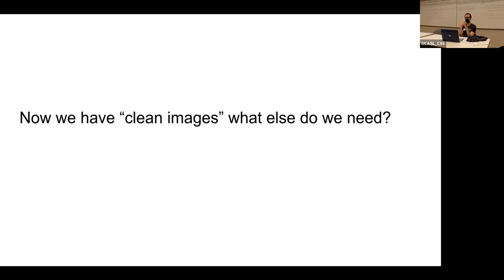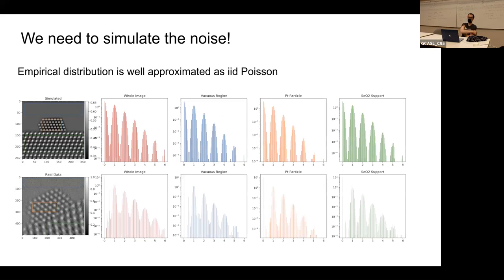But hold that thought, because there is actually a way of training neural networks on noisy images directly. I don't have a slide about that, but I think it's worth mentioning at the end. It's not obvious, but even in very recent work, it's possible to train neural networks with just the noisy images. So indeed, we need noisy images to tell the network to map this noisy image to this clean image. And for that, we have to figure out what the noise distribution is.